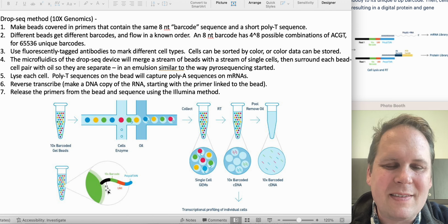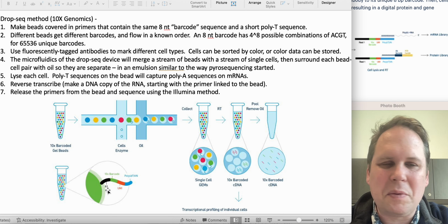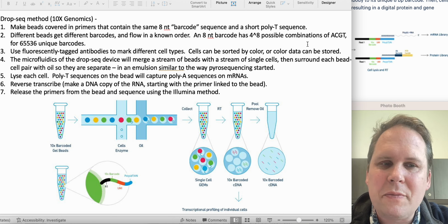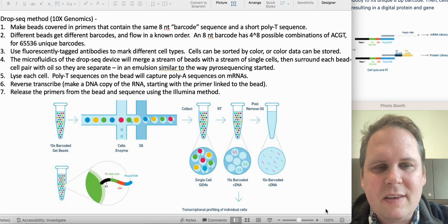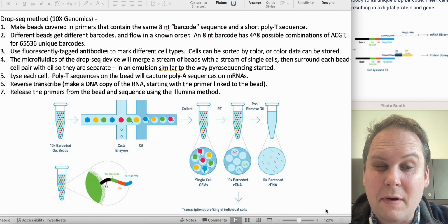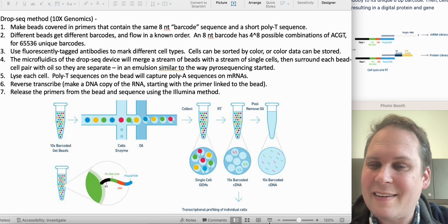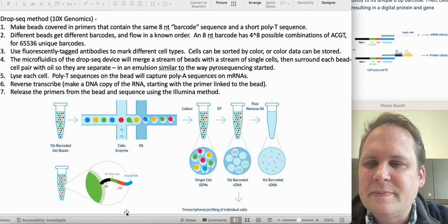I think the maybe second or third section that we went through. But yeah, right now all the readouts on these are with Illumina sequencing. That is the next-gen sequencing platform that is winning or has won. I guess there are some others still out there, but it's definitely winning at the moment.